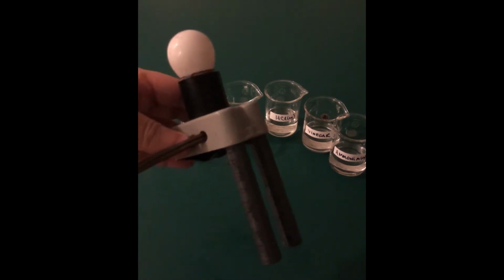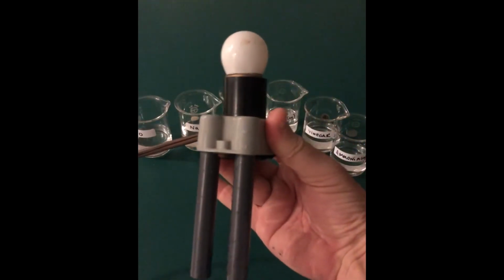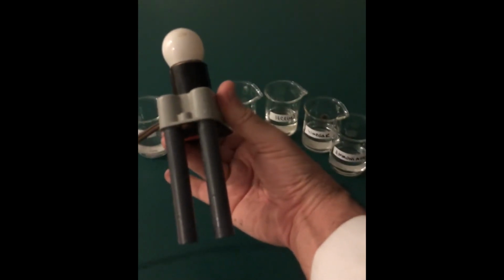And what we're going to do is we're going to probe them with this conductivity tester. Notice that it has a light bulb and it has two electrodes. Of course, they're covered so I don't electrocute myself. And it's plugged in, but right now the light bulb cannot turn on because there is no connection between the two electrodes here to close the circuit.